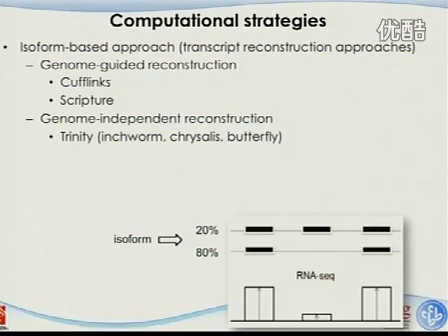For this particular example, you can think probably this isoform is about 20% of the final product, and 80% is this isoform, because the expression level of the middle one is much, much lower. And if you're smart, you can figure this out, right? However, once we have multiple isoforms in one gene, it's pretty difficult. You have to have strategies.